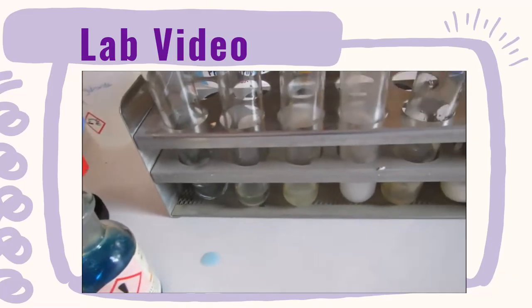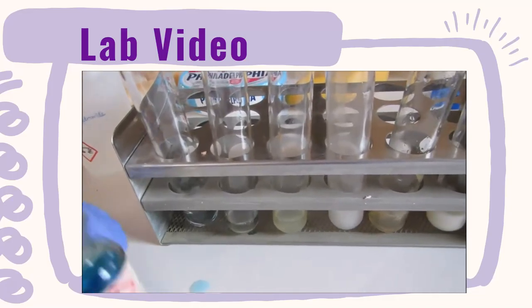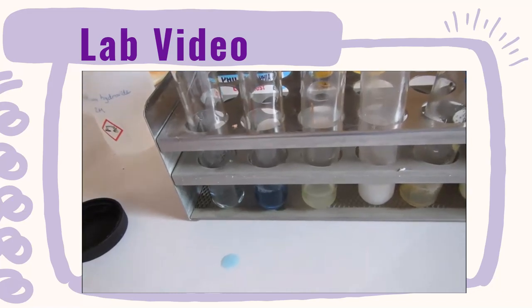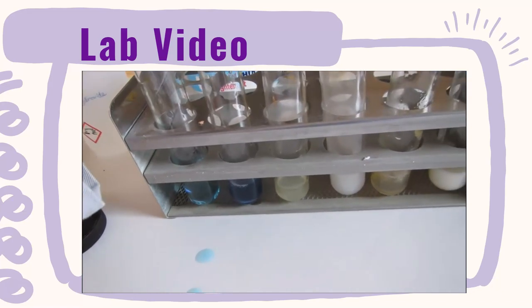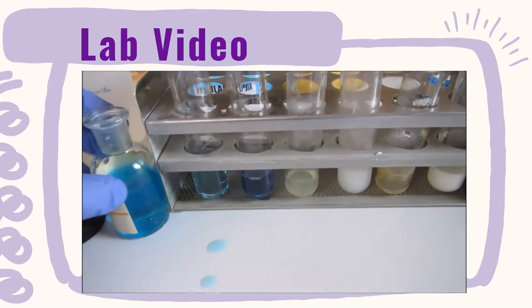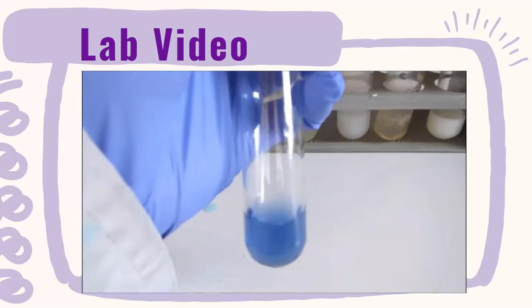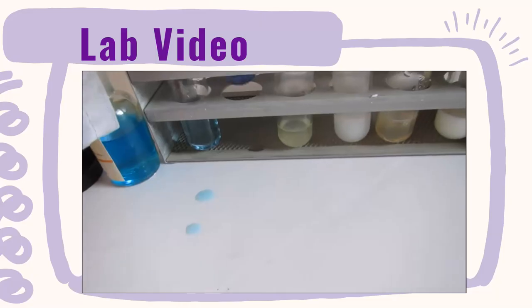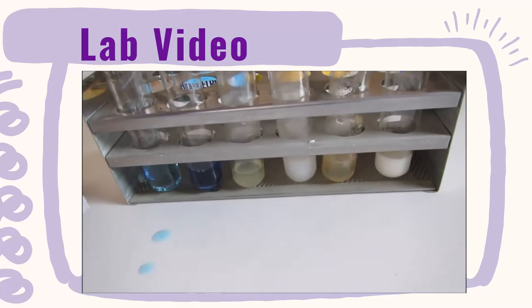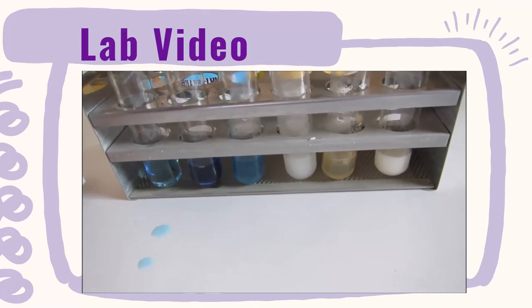So when I add it into the deionized water, it remains slightly lighter blue. If I add it now into our positive control, you can see in the positive control it's gone from this nice light blue to a very dark blue, almost a purple in colour. A bit hard to see the purple colour in the video.